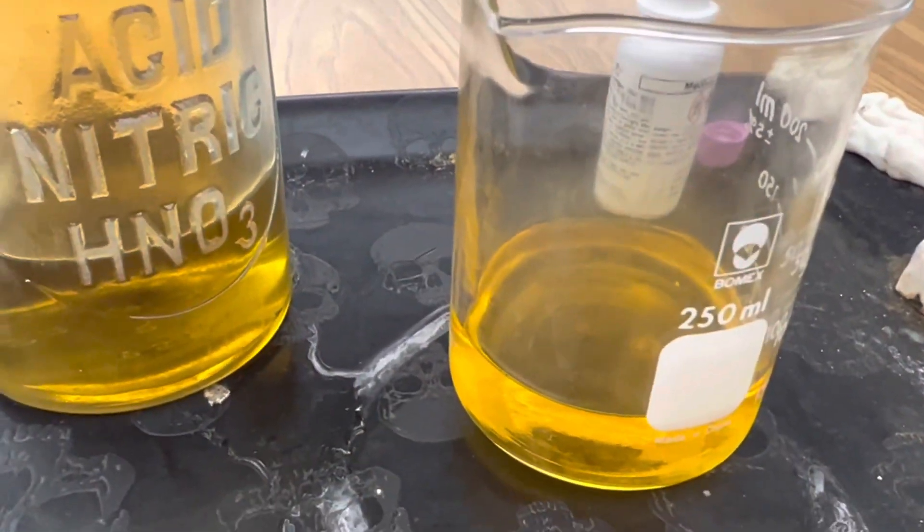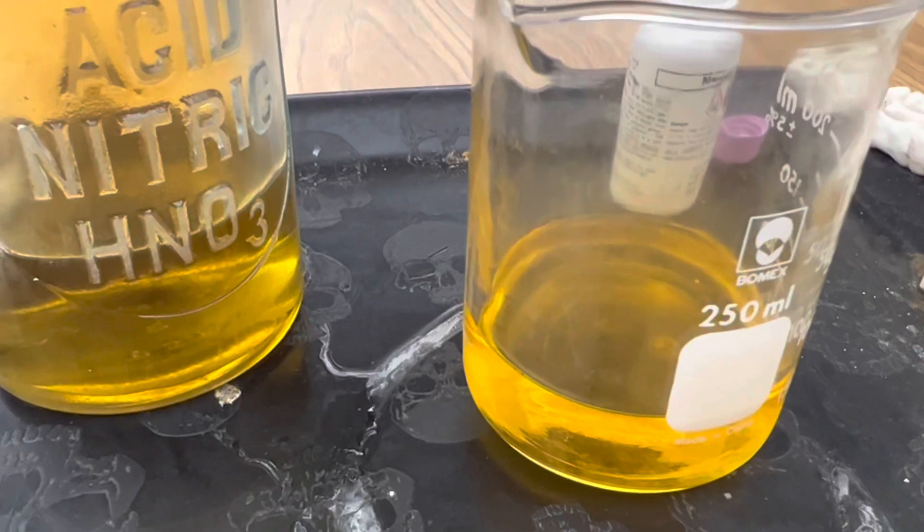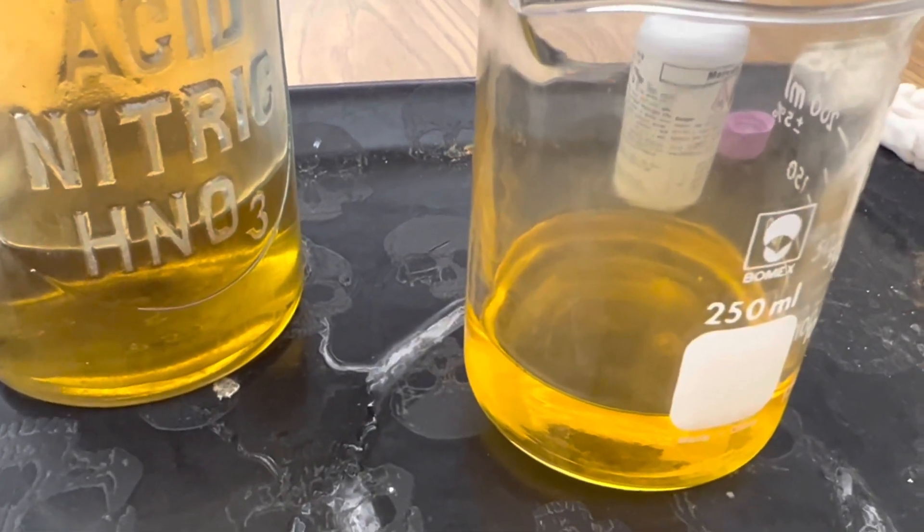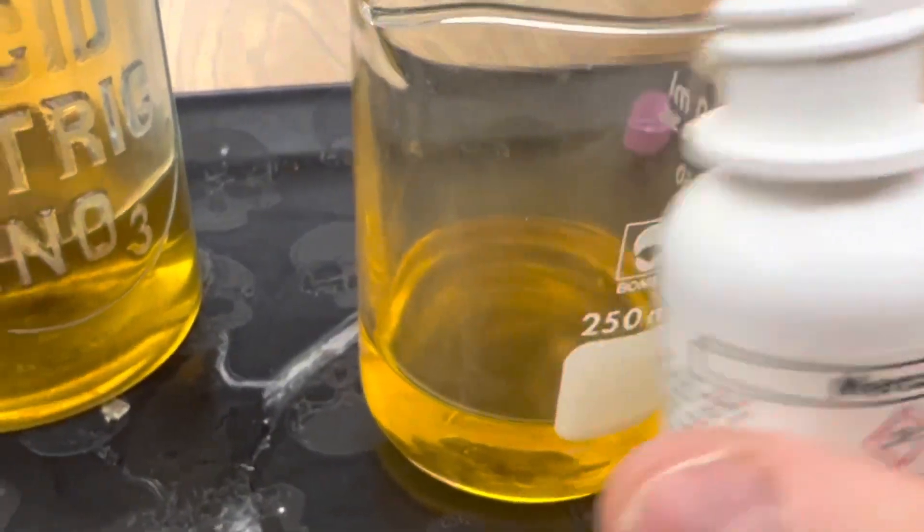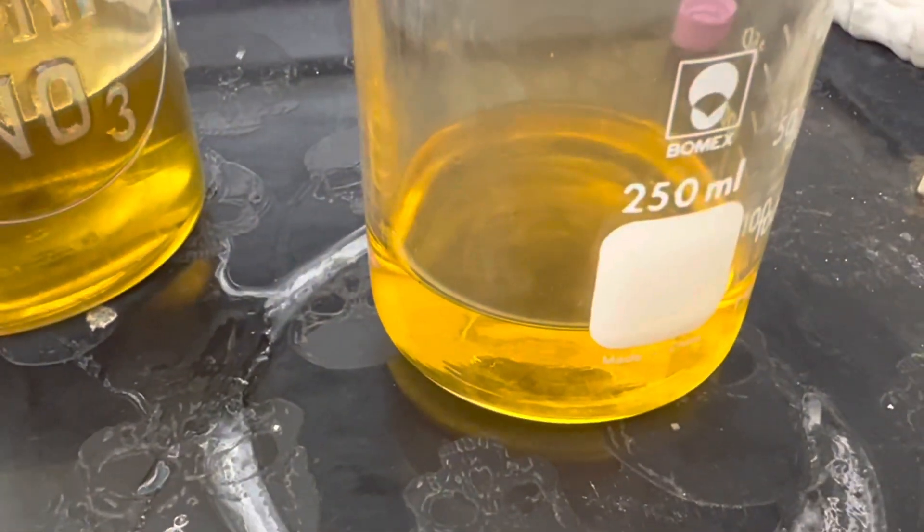The first step is to add 50 milliliters of nitric acid. I'm using 15 molar nitric acid in my beaker and then I'm going to add just a small amount of mercury to my nitric acid.